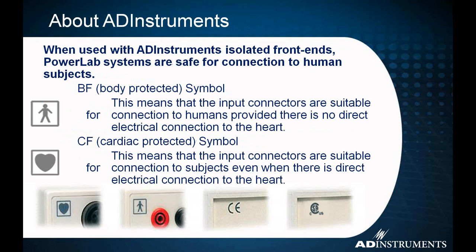And how do I know if my equipment can be connected to a human safely? How do I know what the different symbols mean?